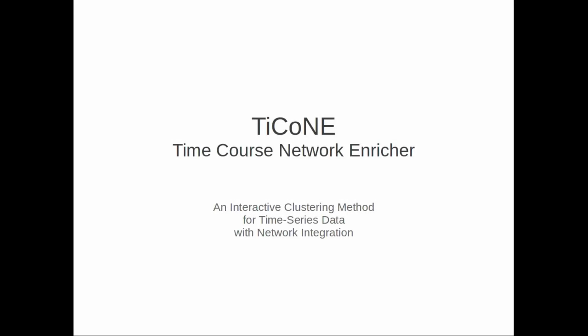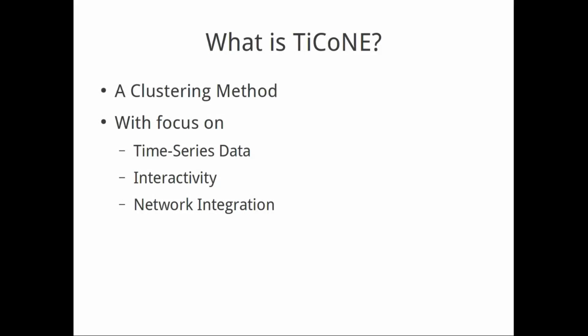Welcome to the screencast of TiCoNE, the time course Network Enricher. What's TiCoNE? TiCoNE is a clustering method with focus on time series data, interactivity, and network integration.